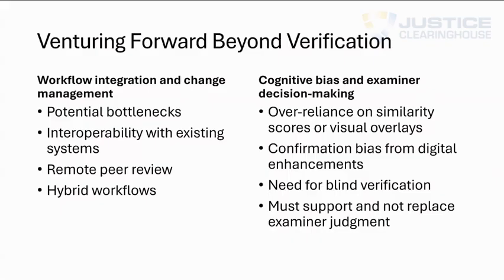So that's how we venture forward beyond verification. There's going to be a lot involved. And again, there are not only laboratory issues that are going to have to be considered, but there are examiner issues that are going to have to be considered as well. And that's why it's important. One of the things I've always thought once I retired from ATF and ventured into private consultation, if you will, was that I was moving into an area where there has to be a bridge between light comparison microscopy and virtual comparison microscopy for the firearm examiner.